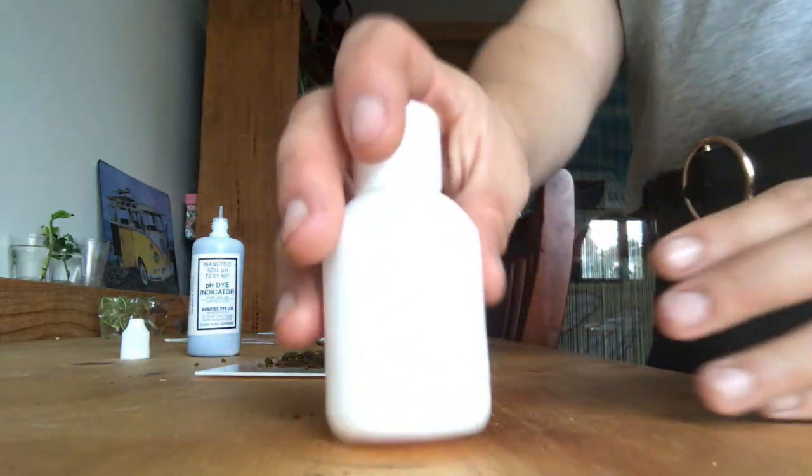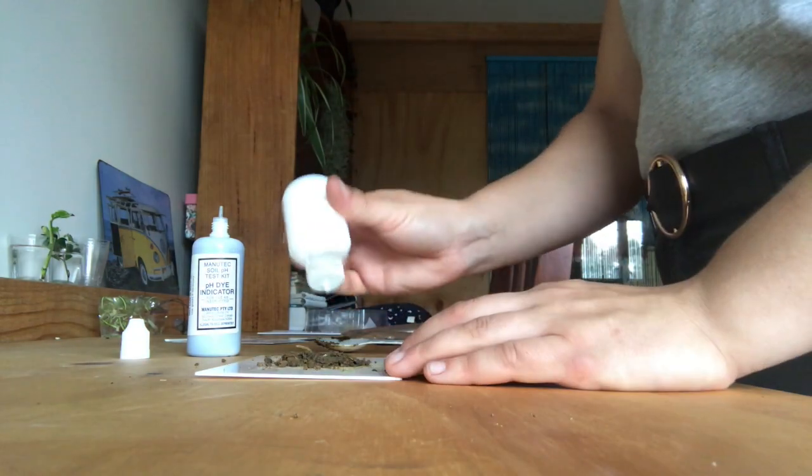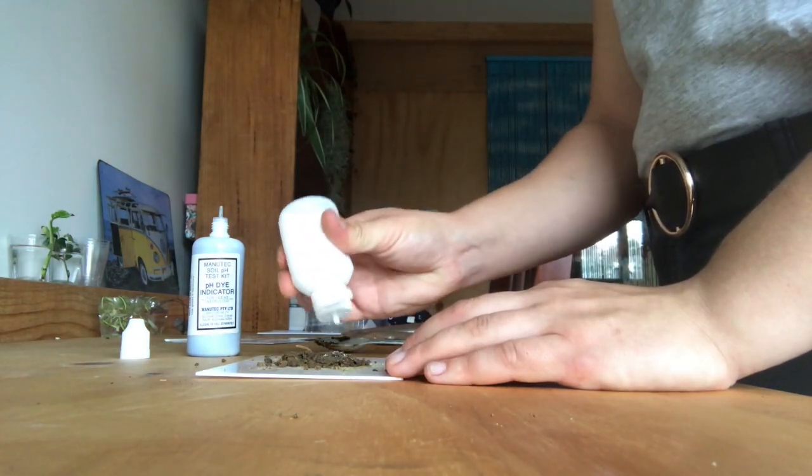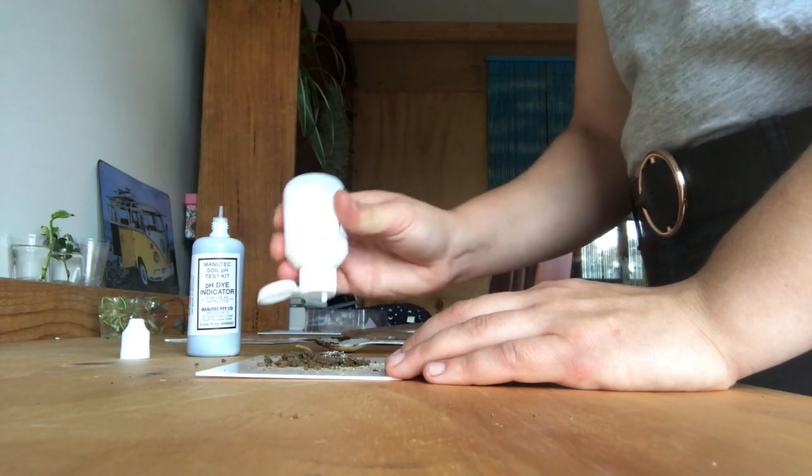Next, we will grab our barium sulfate. And all we want to do is sprinkle enough on the sample so that we can begin to see a colour start to appear.